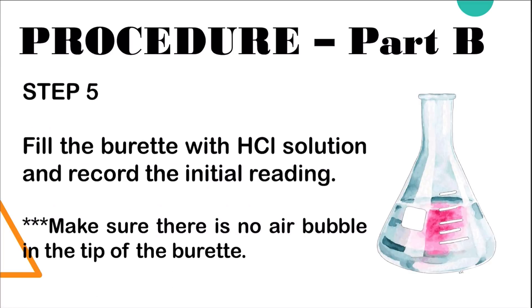Step 5: fill the burette with hydrochloric acid solution and record the initial reading. You have to make sure there is no air bubble in the tip of the burette.